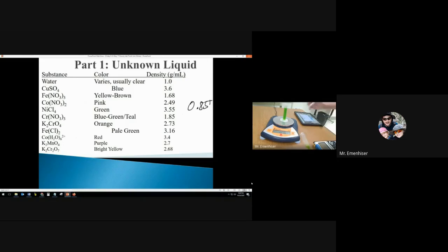Looks radioactive or something. Okay, so here I'm kind of rounding it to 0.9. I'm saying, okay, we're getting close to 0.9, and what we need to get for the density of this liquid is really close to 1. We just had some error, so just know that the density of this liquid is close to 1 based on what I got.